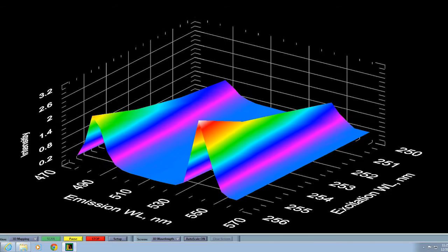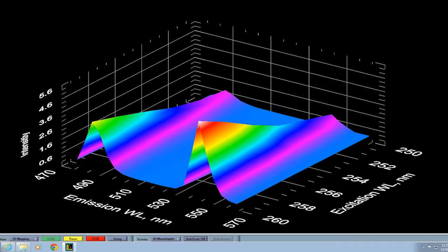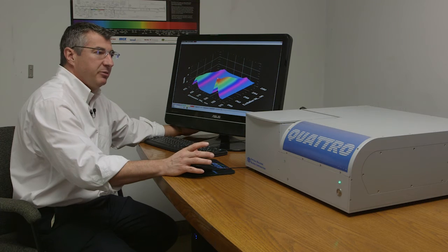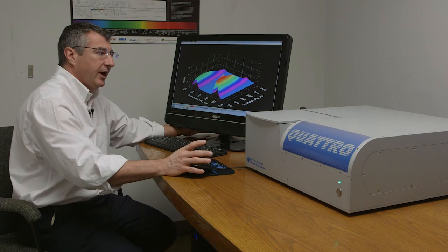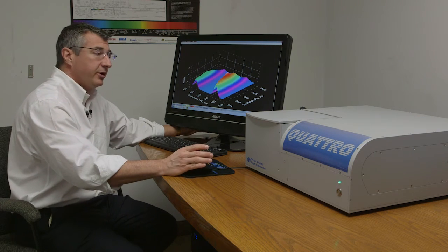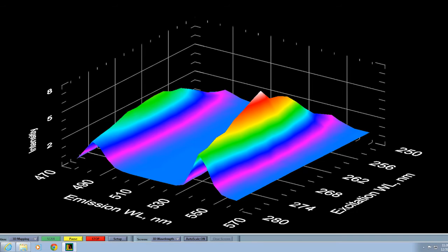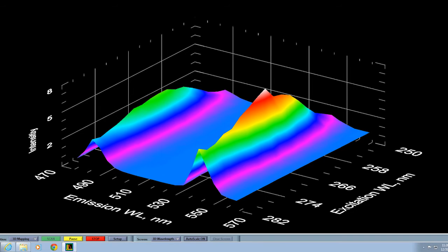So here we're collecting an emission spectrum at a variety of different excitation wavelengths. It's reporting the three-dimensional construct in real time for us. This is a monochromator based system. These are very large, very high resolution, very accurate monochromators, 250 millimeter length monochromators. So it's actually doing a really good job of scanning this entire matrix really very quickly.